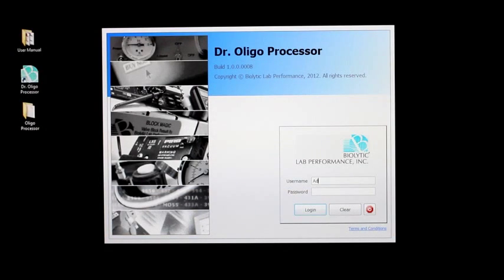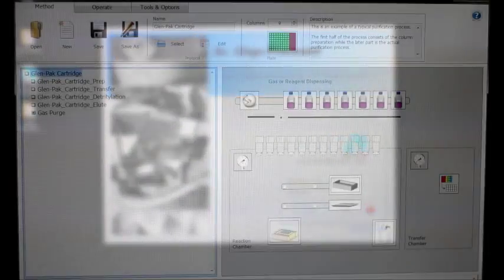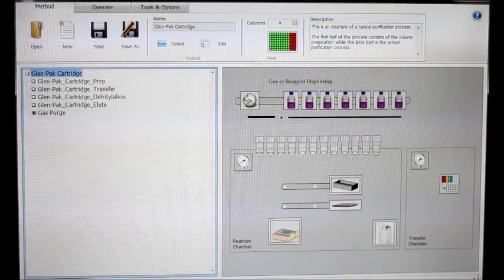This is the main login screen for the Dr. Oligo Processor software. A main benefit of our software is that it allows multiple users to have different levels of accessibility. This is the main user interface for the Dr. Oligo Processor software.